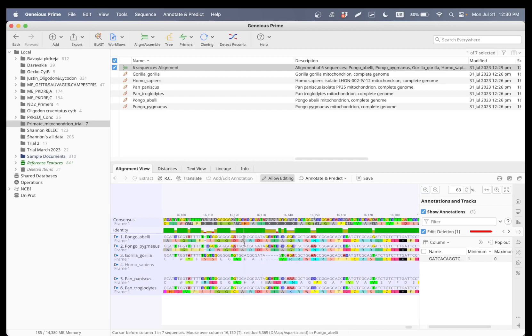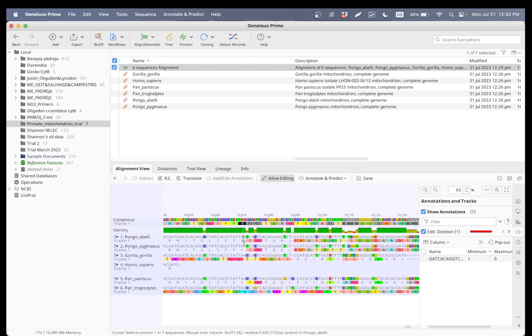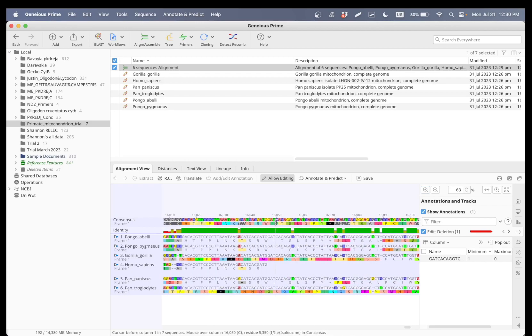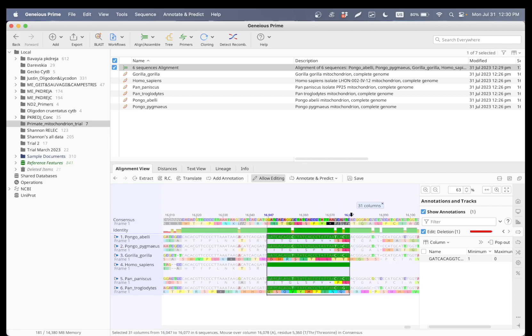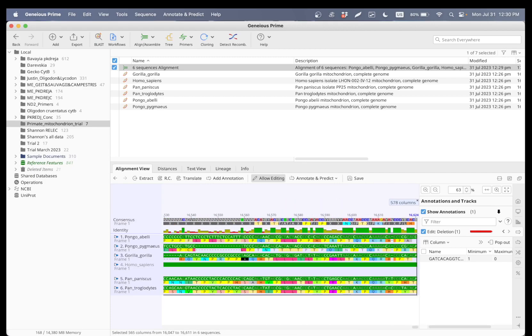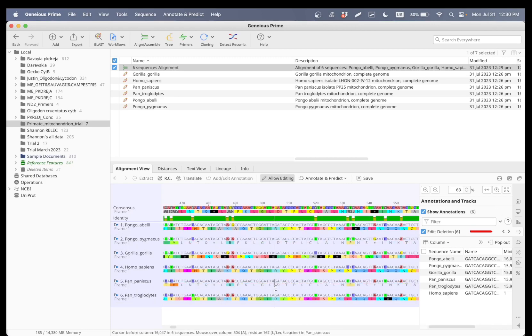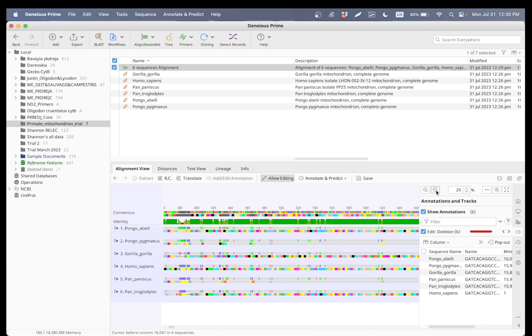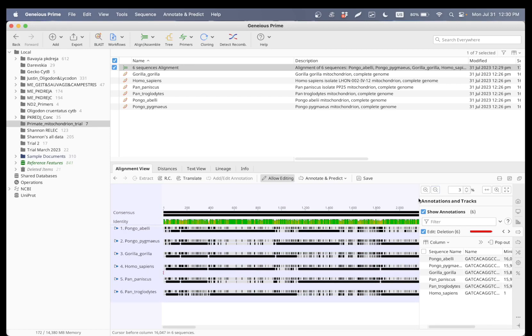So I can have sequences that are equally long. Let's get this part as well — press delete. And now we have all of these sequences covering the exact same spots, the exact same regions, and they're equally long.